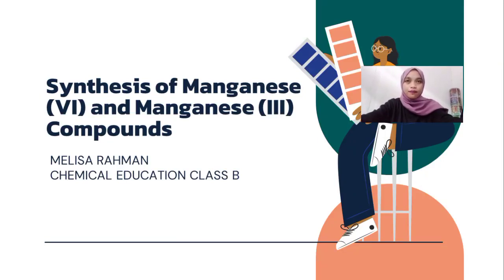Hello everyone, I'm Melissa Rahman, and this time I will explain the experiment synthesis of manganese 6 and manganese 3 compounds.